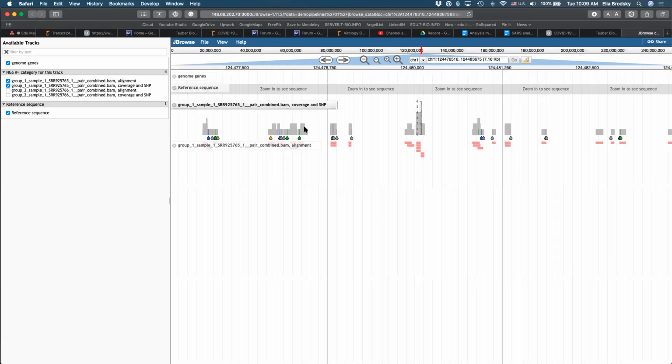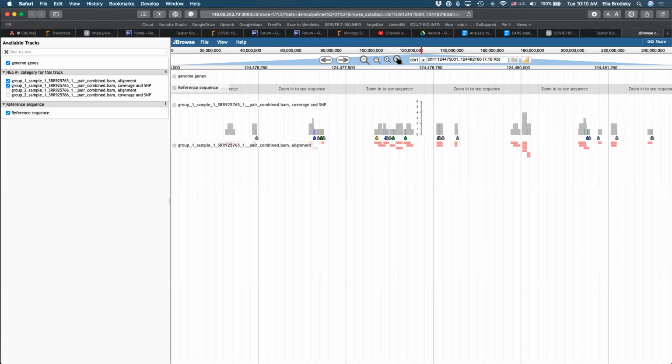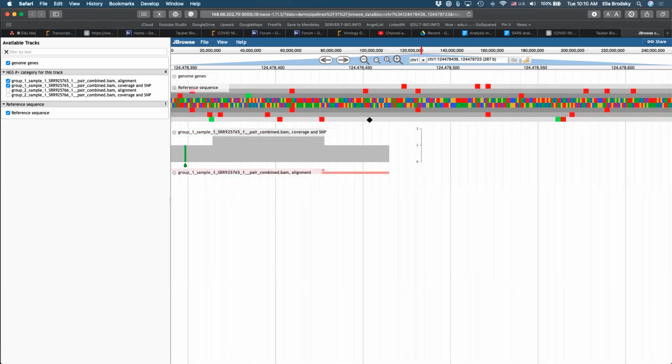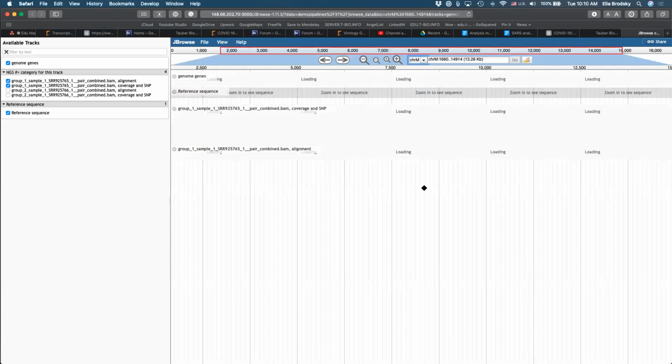Okay, let's just zoom out until you see these individual signs right here. Okay? So what are these little signs? Let's zoom in. Right, well, don't go out too much. Just go a little bit. And what are these individual signs? What is chromosome M? Mitochondria.